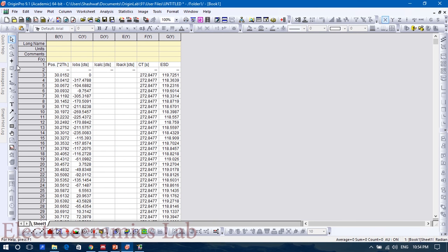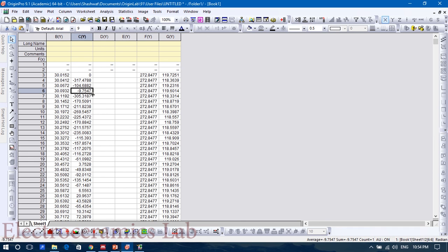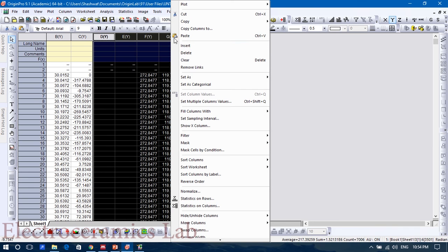This is the angle data. You can delete this also. You can delete these two.